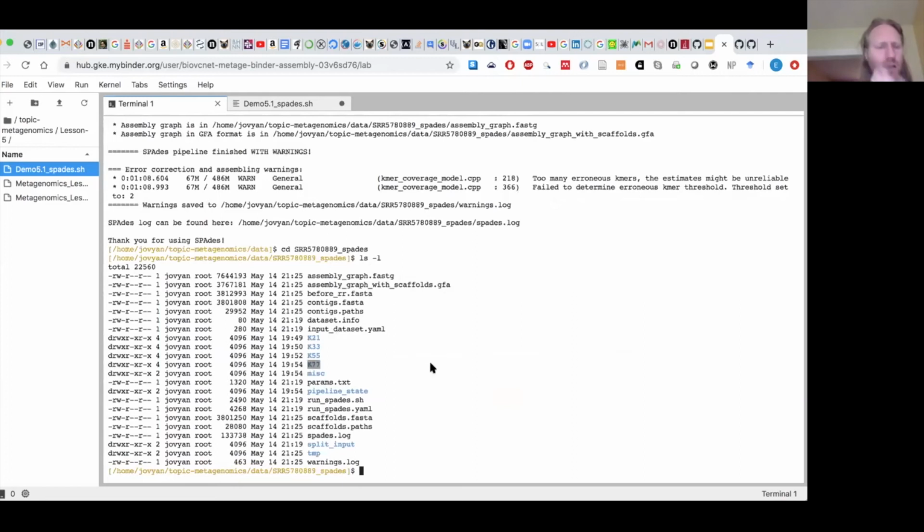I think Spades has gotten better about keeping around unnecessary files, so they may not take up a lot of room, but if you're using older versions of Spades, they essentially kept a complete copy of all the data at each step. So you want to erase those.